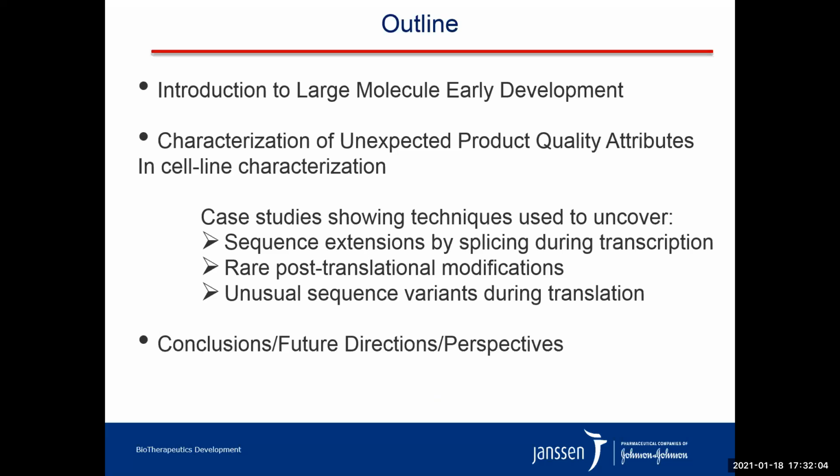Here is an outline of my talk. First, I will give a brief introduction to my group's role in large molecule early development. Next, I will describe several case studies focusing on mass spectrometry and related techniques that were used in characterizing sequence extensions, rare PTMs, and amino acid misincorporations that are otherwise elusive under standard modes of operation. Finally, I will conclude my talk by summarizing our findings and what we hope to accomplish in the future.